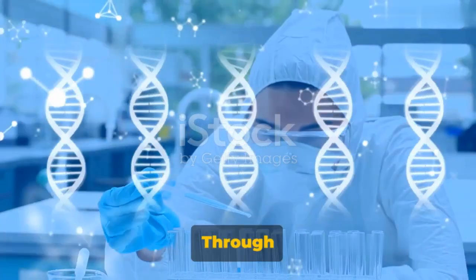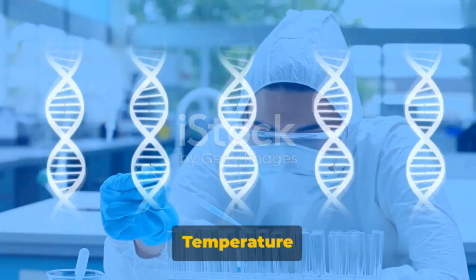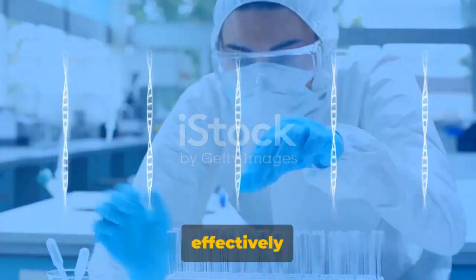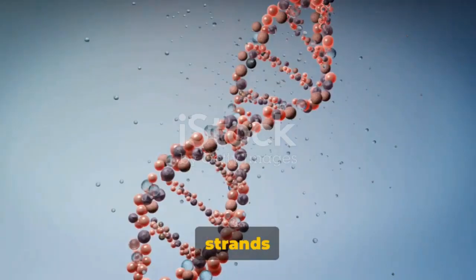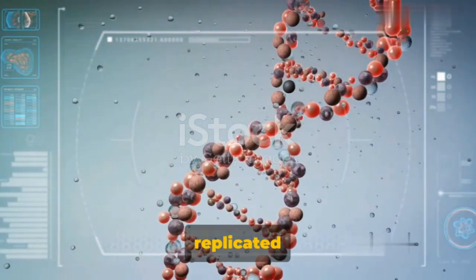So there you have it. Through the amplification process, we've managed to replicate our DNA. Temperature control is key in each stage, influencing how effectively our DNA is prepared, primers bind, and new DNA strands are synthesized. With amplification, we've successfully replicated our DNA. But how do we detect it?